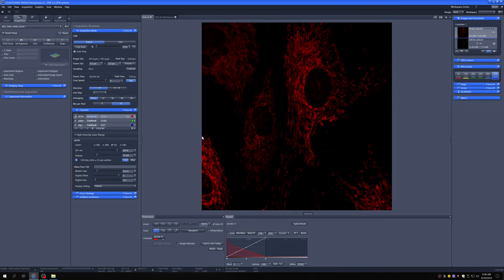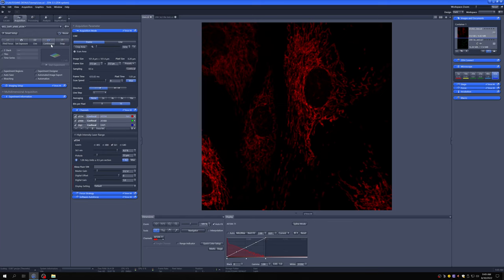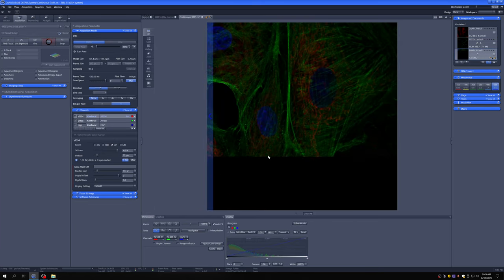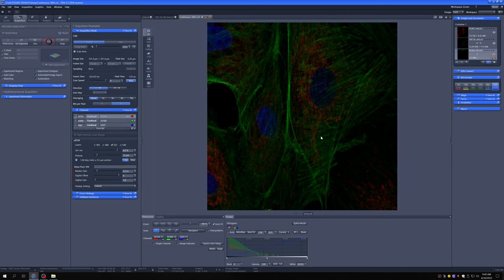When we make these adjustments here, if we go to live, we're not going to actually see the result because live doesn't do exactly what it says here. It's sort of a quicker scanning mode. So we're going to use continuous instead, which does exactly everything that says here. When we're in continuous, you'll see that all three channels are now imaged simultaneously because it just does exactly what it says here.